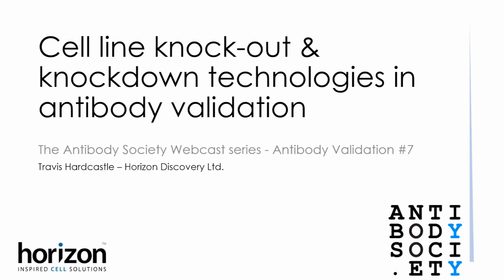I wondered, are your cell lines, I guess they're predominantly human? Yes, Simon, that's correct. We do have many of the common human cell lines that are used at least for cancer research in-house. So HCT116, RKO cell lines, et cetera. But I think our main technology and one of the main cell lines that we use that allows us to do this is our haploid cell lines, which is a near haploid cell line.